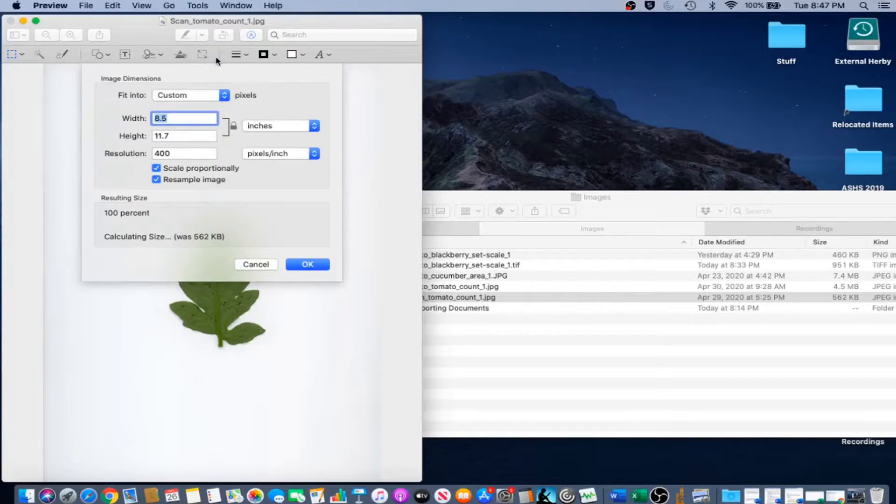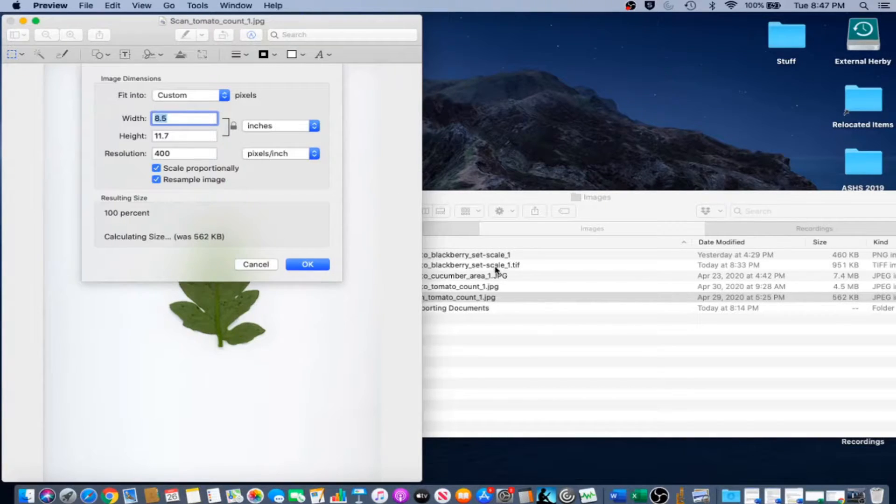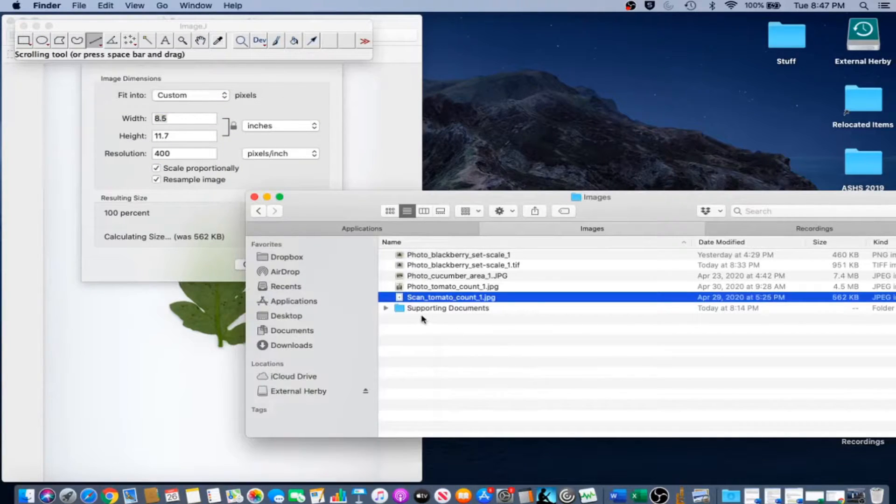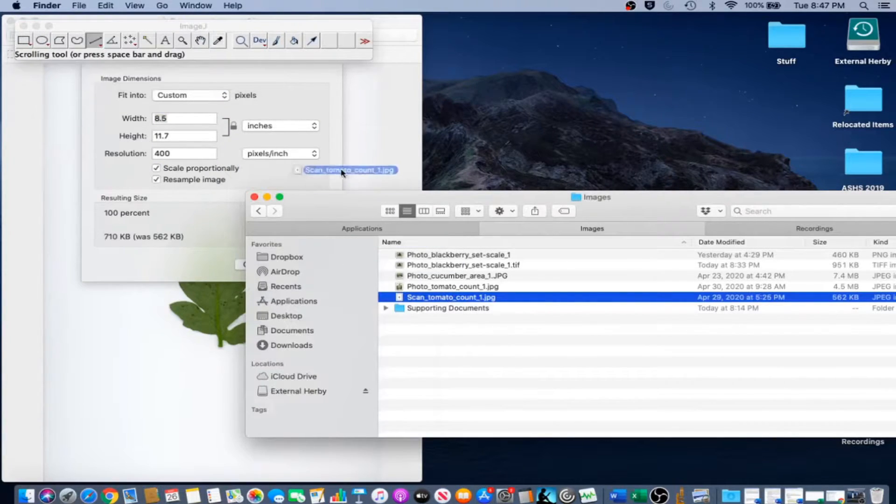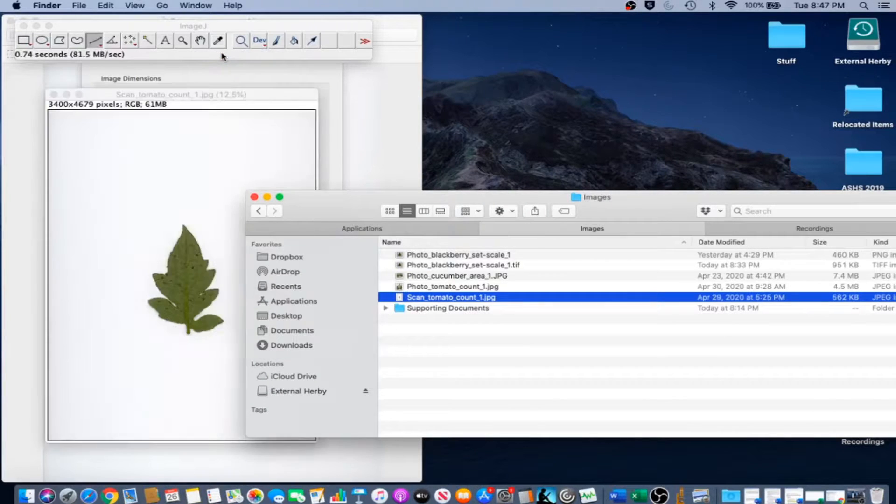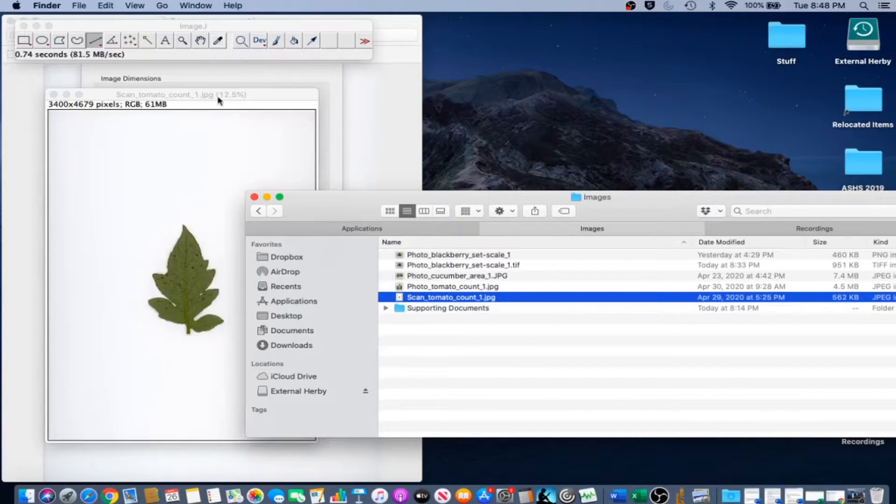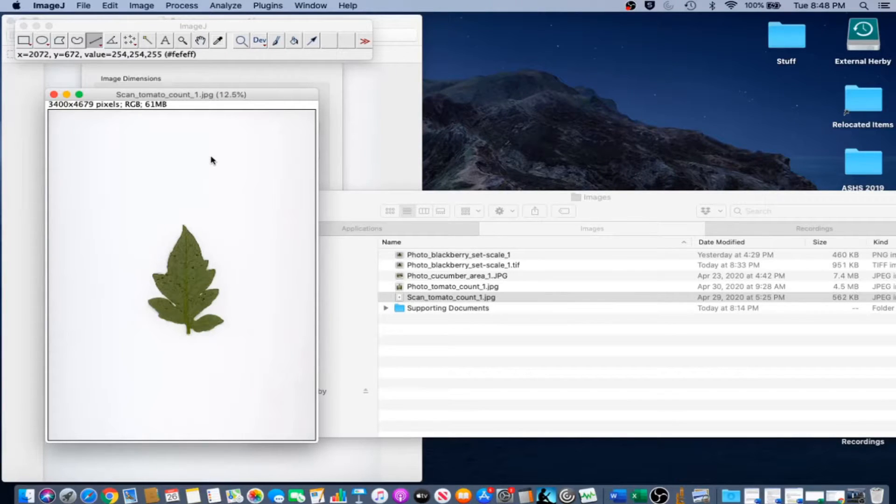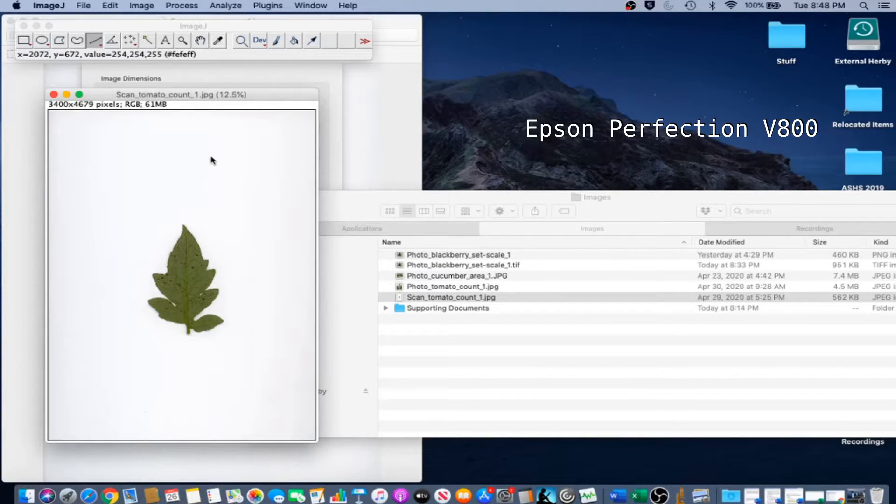The second step to scaling a scanned image is to import the image to ImageJ. We're just going to do the drag and drop technique this time around. This is a scanned image of a tomato leaf from an Epson Perfection V800 flatbed scanner.